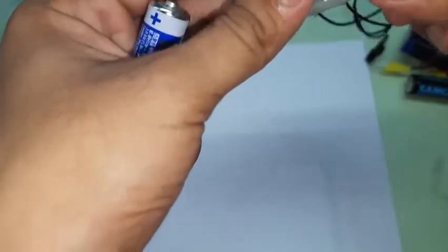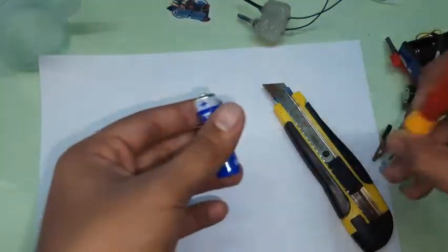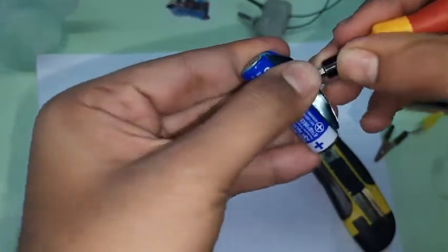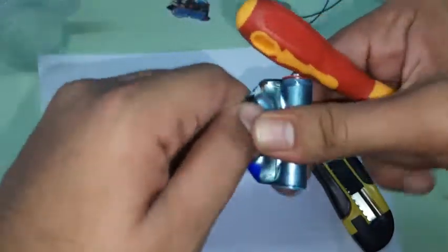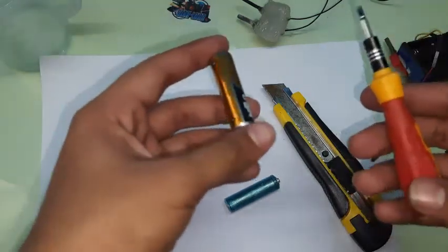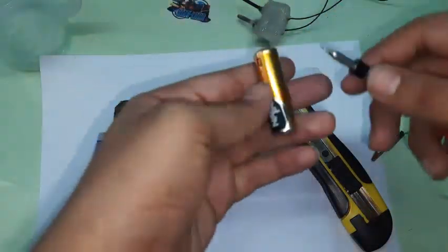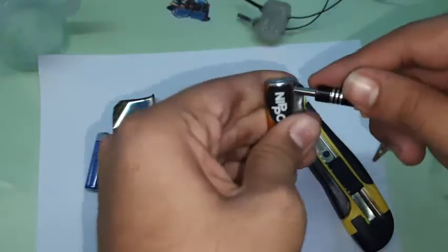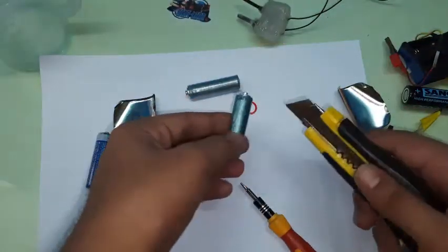To open the battery, you need a screwdriver and a utility knife. Take off the outer covering using the screwdriver. One way to tell if a battery is easy to open is to check if it has an outer metal sheet covering — most that have a metal covering like this one are pretty easy to open. You need two electrodes from two batteries; each battery has one electrode.